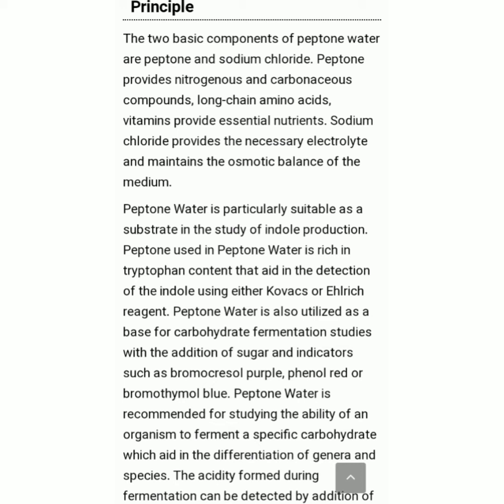These are the essential nutrients required for the growth of microorganisms, and peptone broth provides them, right? The other component is sodium chloride, which is an electrolyte and maintains the osmotic balance of the medium, right? Peptone water is particularly suitable as a substrate in the study of indole production. And this is a very important point that you have to learn: tryptophan is very rich in the peptone medium, right?